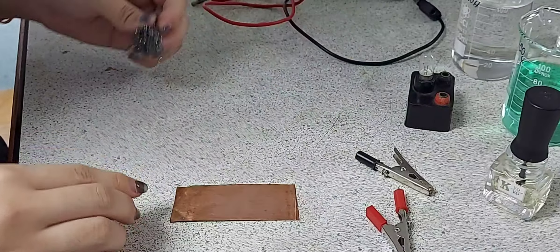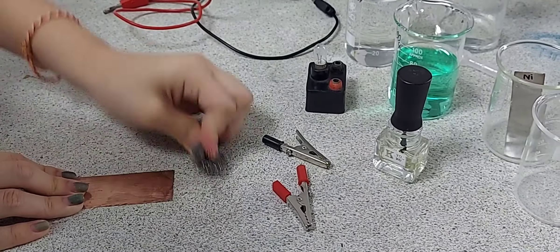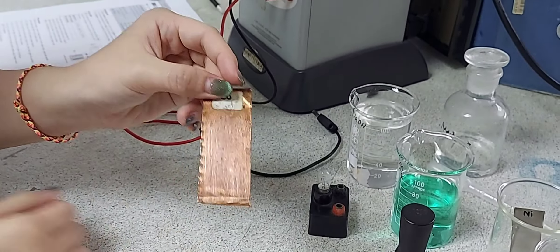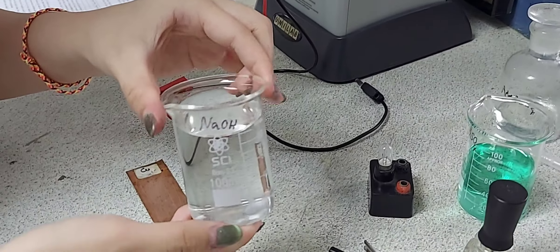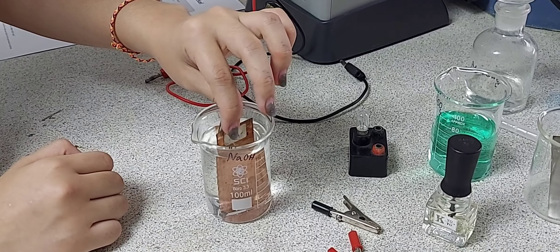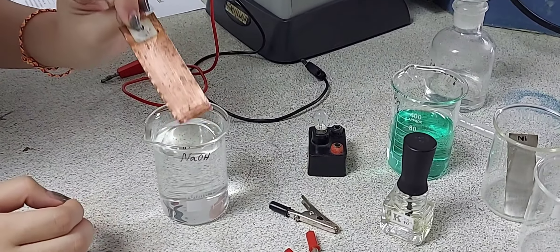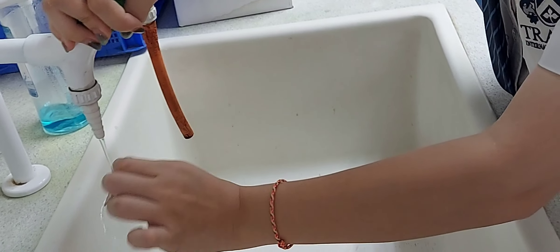Here we are cleaning the copper electrode and the nickel electrode. This is done with sandpaper to remove all the deposits which may have formed as a result of oxidation — the slow oxidation of the metal. Once the electrodes are clean, you take them and dip them in sodium hydroxide solution to ensure they are clean, then the electrode is washed in tap water and dried using a paper towel.